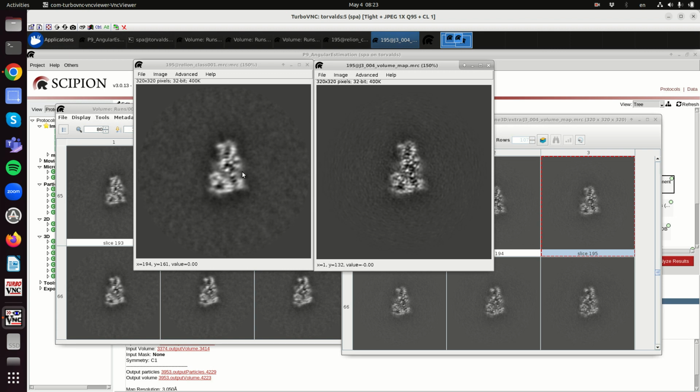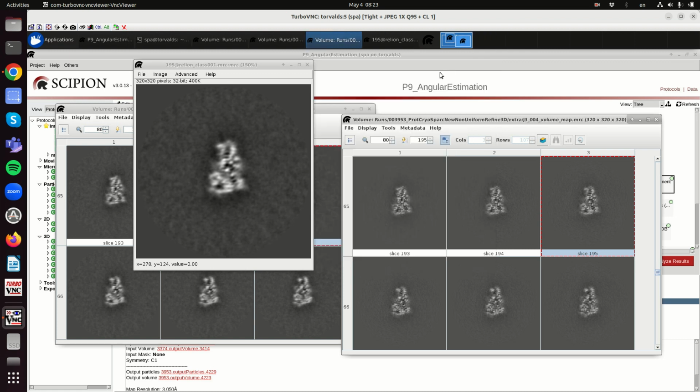Somehow it is indicated by this resolution increase from 4.7 to 3, but that doesn't mean we should believe these 3 blindly. Okay, so better resolution probably means better quality. What the exact quality is, is a different matter.